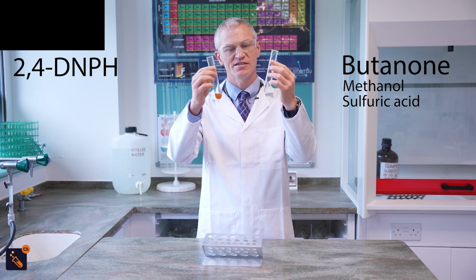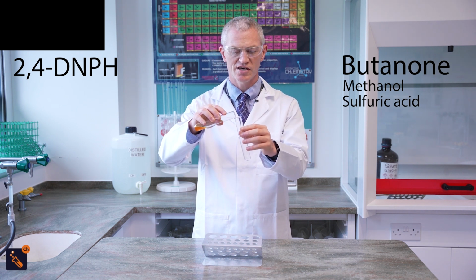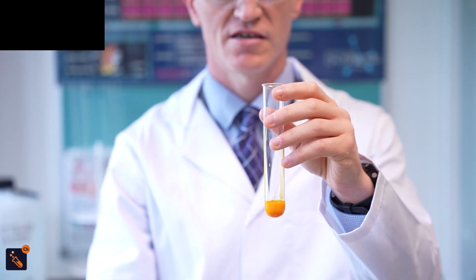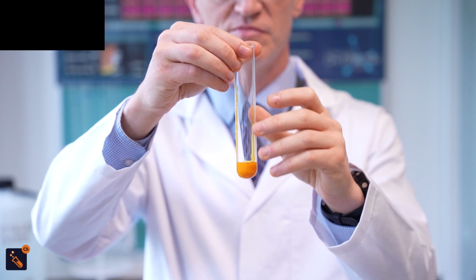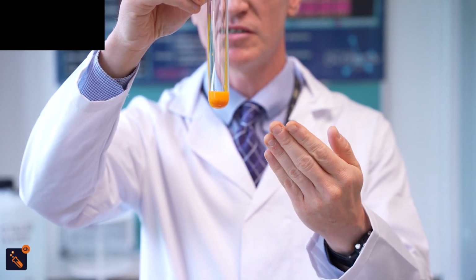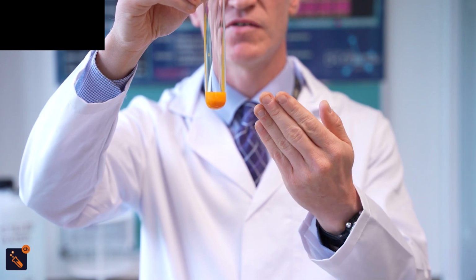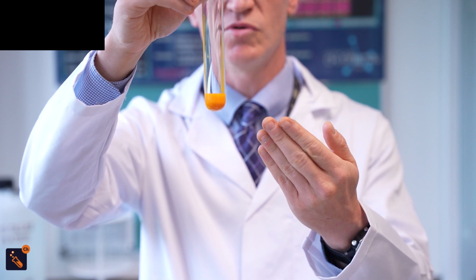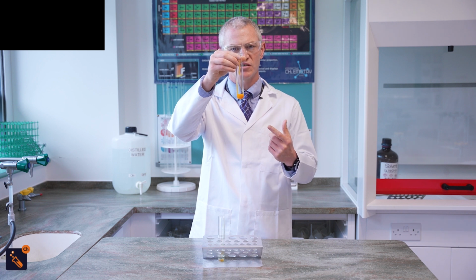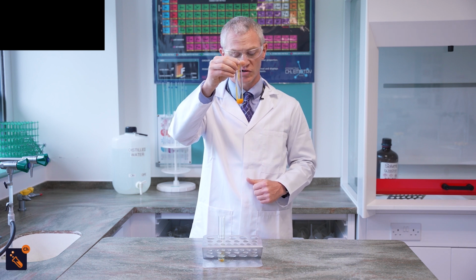All you then do is take the two samples and add them together. You see straight away that the precipitate is produced, and you have this orange precipitate. Remember, it can also be yellow depending on what it is, and you have that precipitate produced. It proves you have a carbonyl inside your molecule. So what we can do now is we have to recrystallize this sample to turn it into a purer sample.